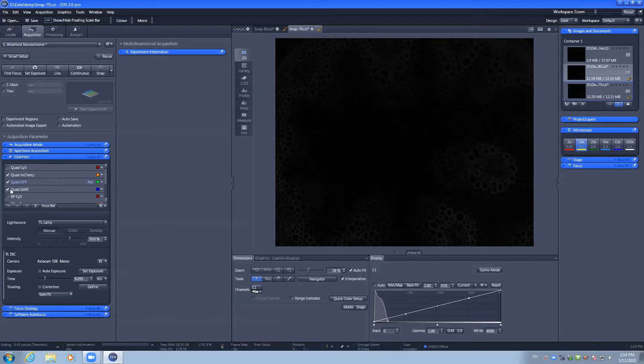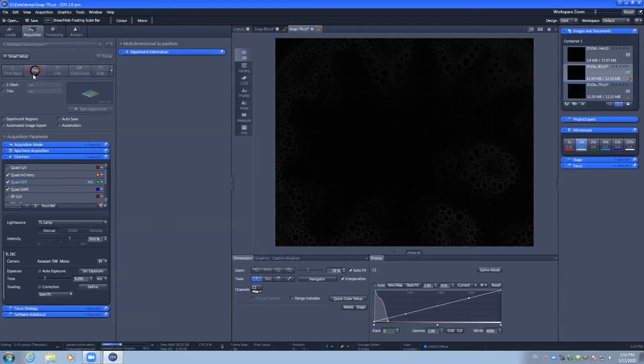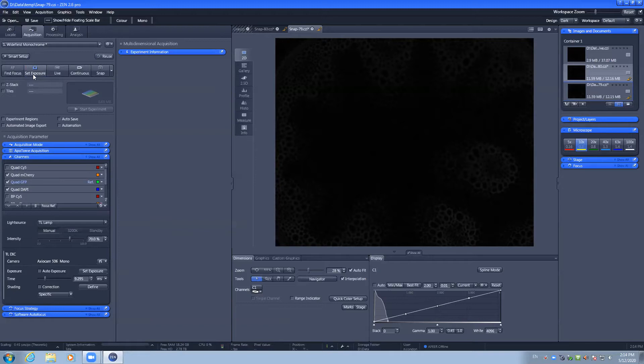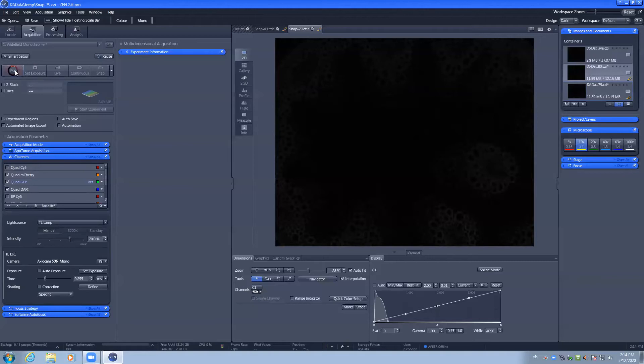By selecting these, I can run a set exposure which will go through these three channels and configure the exposure time settings, and I can also perform a fine focus to run autofocus on my sample.